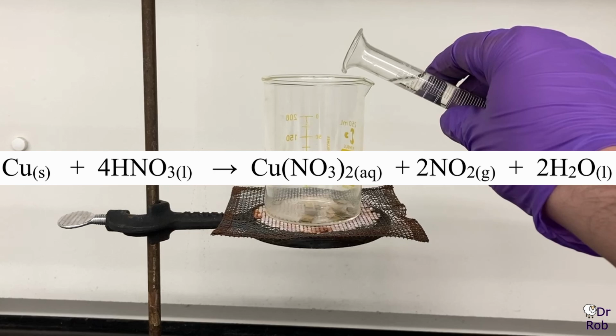The reaction is also exothermic, so you're going to be seeing a little bit of warming, although the bubbles being produced aren't water boiling, that's just the gas that's forming. And like I said, if you used a dilute solution of nitric acid, that gas would be NO. You might still get some NO2, but you're going to get some NO as well. And that's colorless, so it's not quite as showy as that. So let's go ahead and get this started.